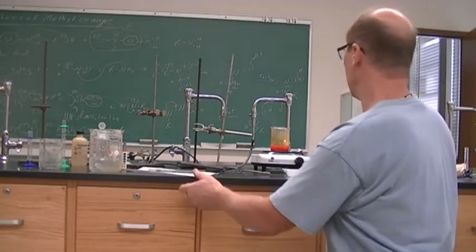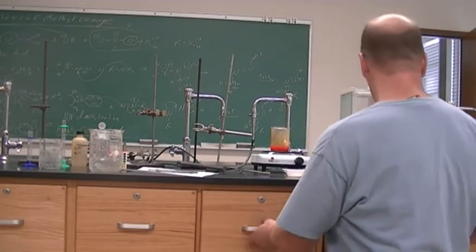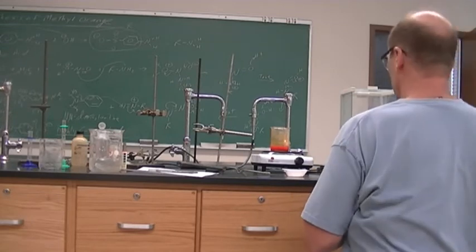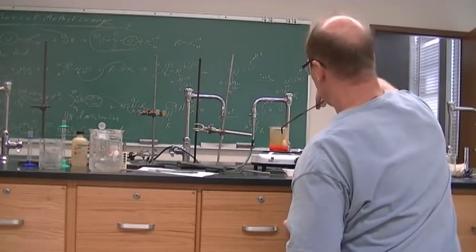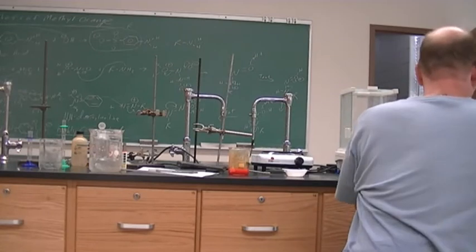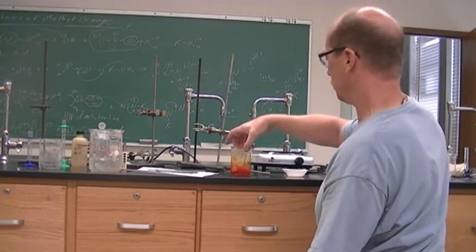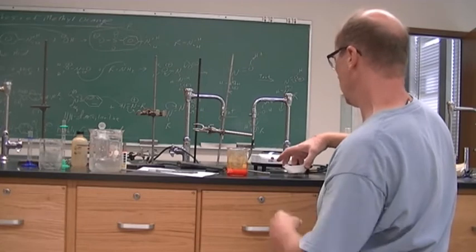So I'm going to remove it from the heat. Add the NaCl.